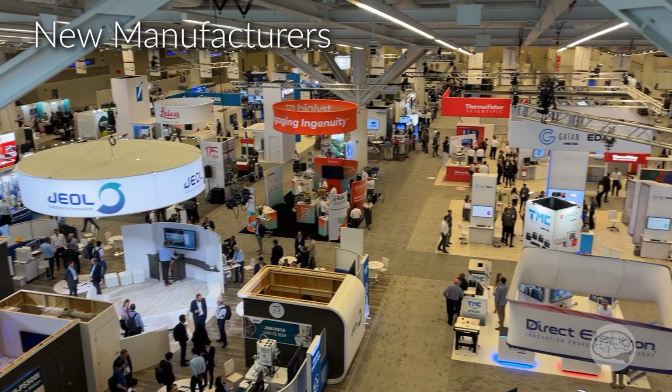And so on top of those 4 companies, I know of at least one other manufacturer from South Korea that is likely looking to enter the US market with a tabletop, tungsten, and Schottky SEM. From my view, that is a lot of competition over the tabletop/tungsten SEM market, because don't forget that the 5 major EM manufacturers also all have instruments that are competing in this space and are also well established. So it will be interesting to see how this all shakes out over the next 5 years or so.